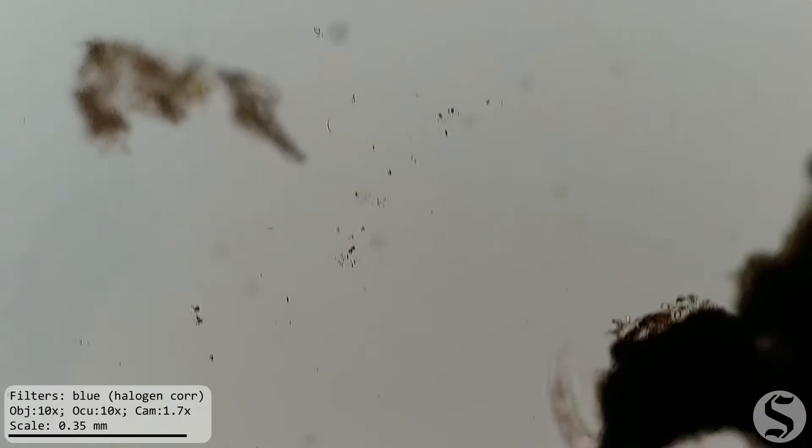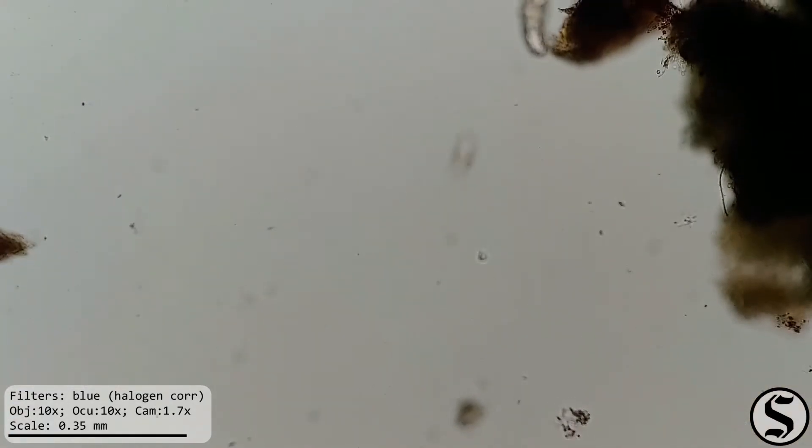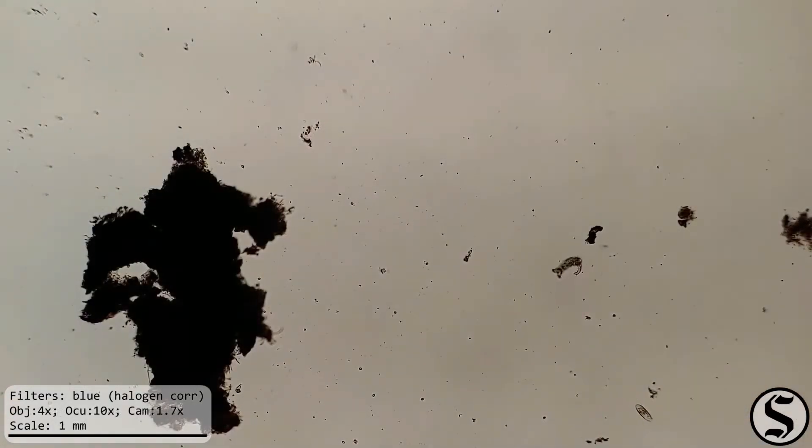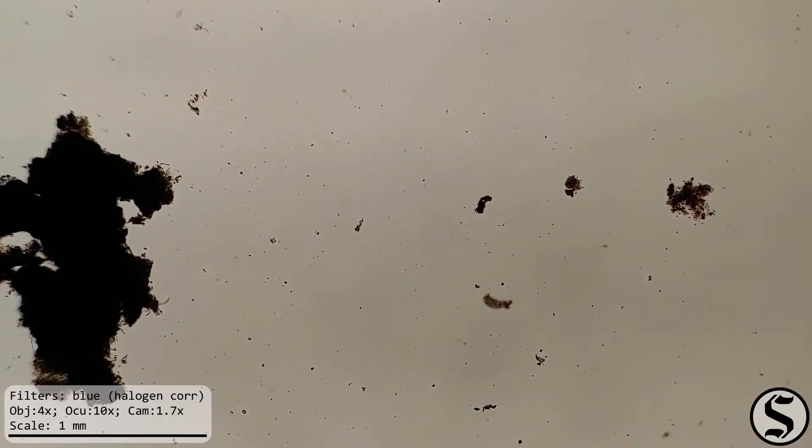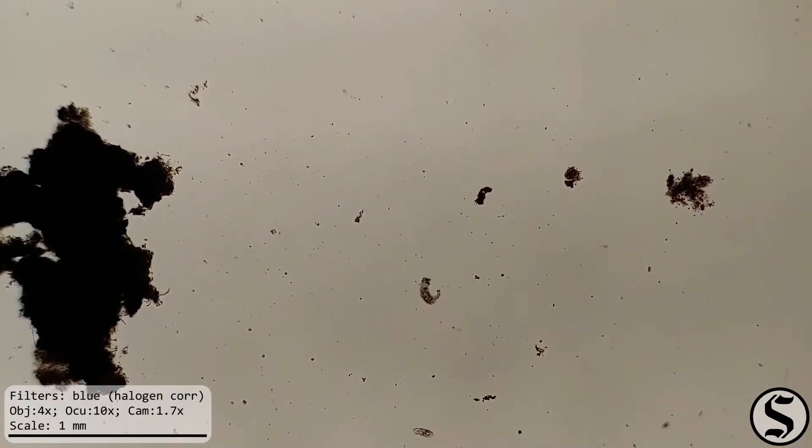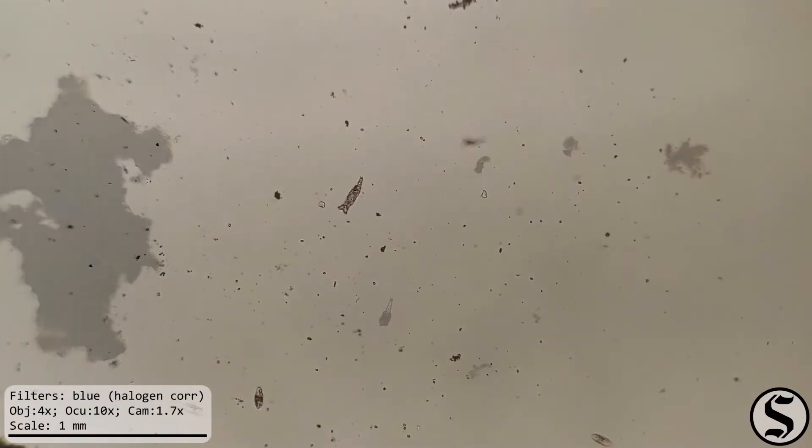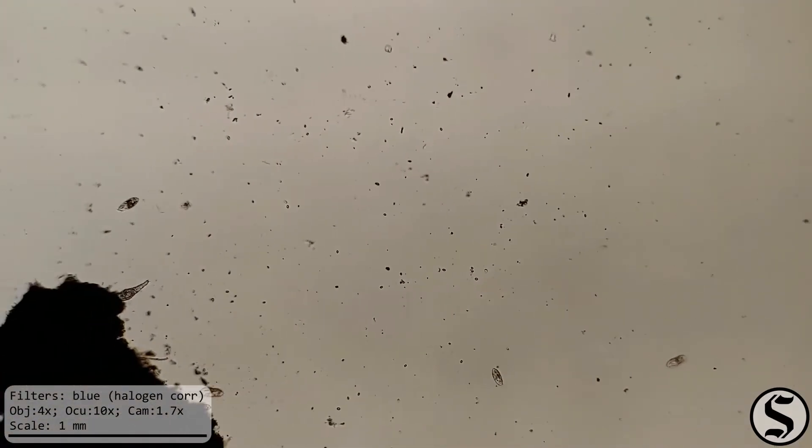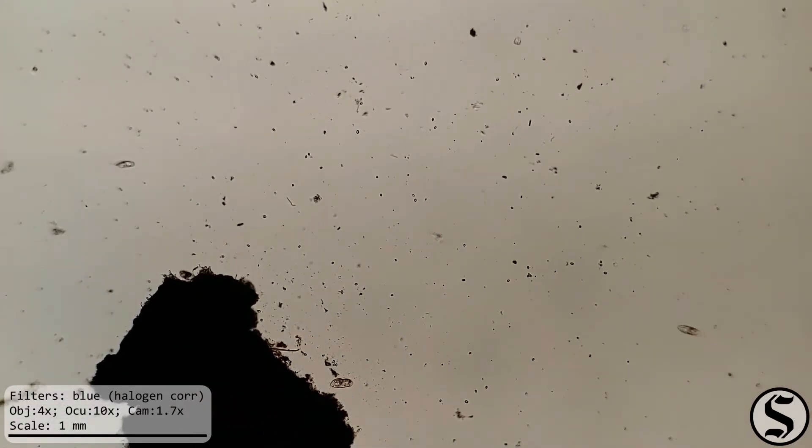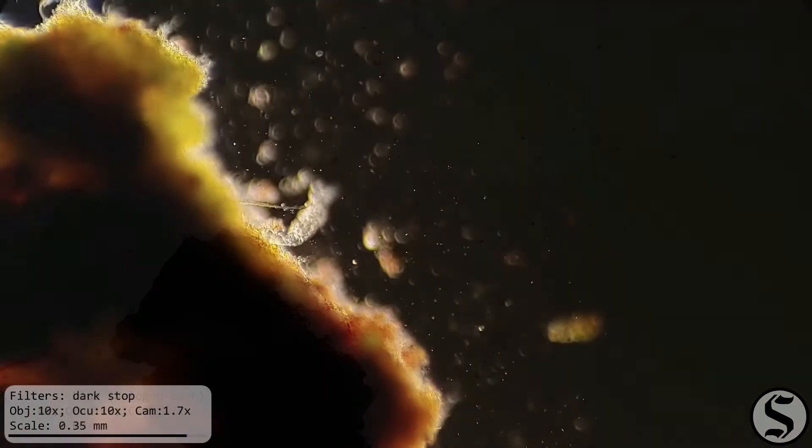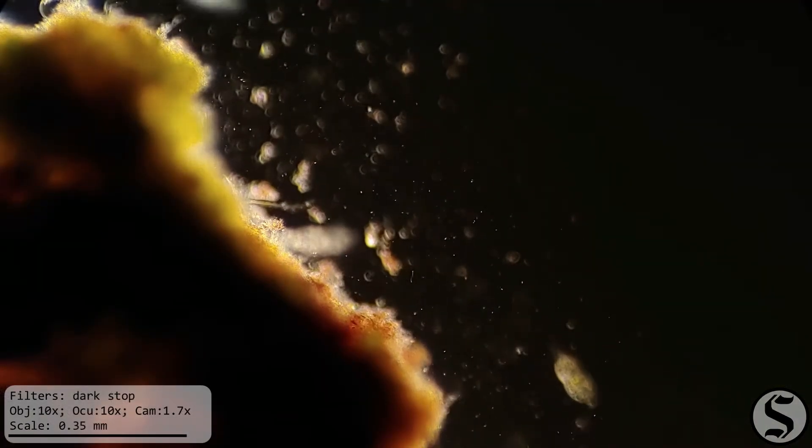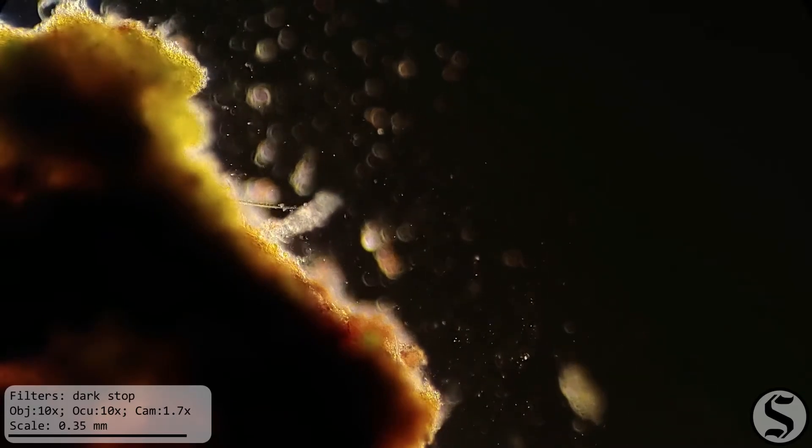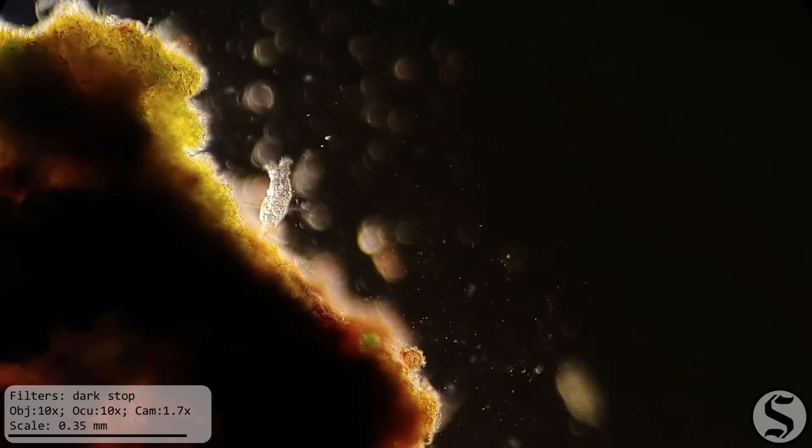So I filmed him for a while. He kept launching himself off of substrates and twirling and swirling. Eventually he did land on another substrate and stayed still for long enough for me to get another look at him. I decided to use some dark field. It really shows off how much his cilia get the water moving. You can really see all those particulates swirling around.